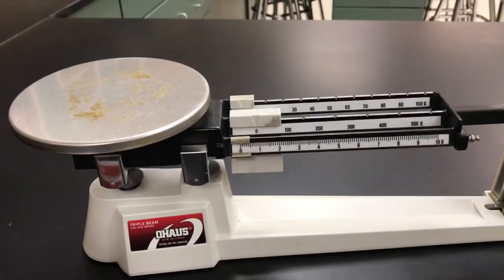Hey, it's another Friday — made it again! Big weekend ahead of us, maybe. Today and next week we're gonna be in the lab a lot. We're gonna be doing a lot of measurement things, and you need to get introduced today to a triple beam balance — what it measures and how to use it. Triple beam balances are used to measure the mass of an object.